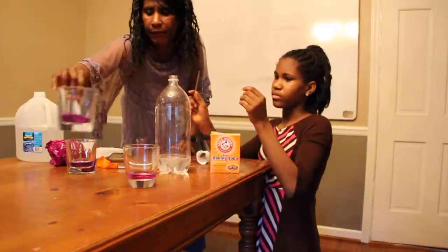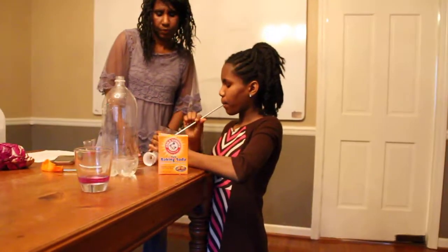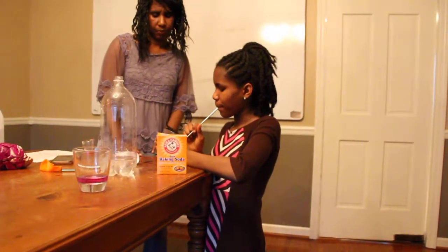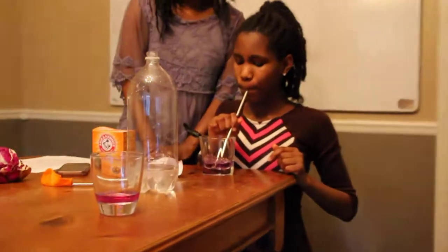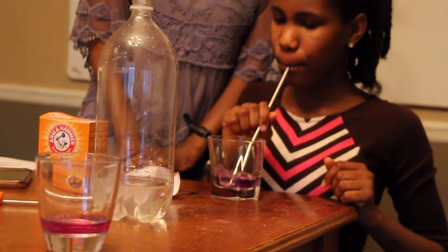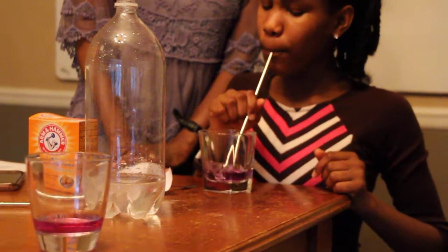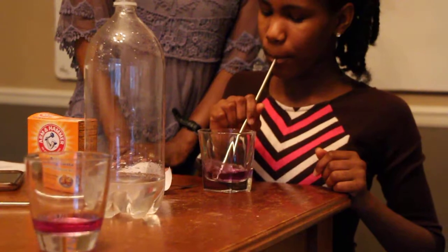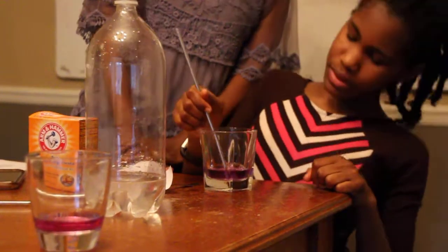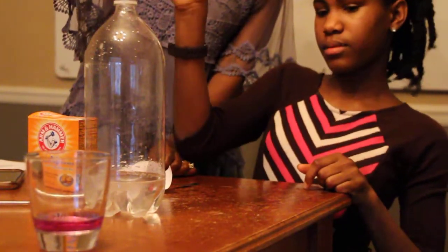Okay, so this one we haven't done anything with. This one we took the balloon in, and this one Skylar's going to blow into. Do I keep going? Nope. Okay, let's see if we get a difference. No. No, maybe. All right.